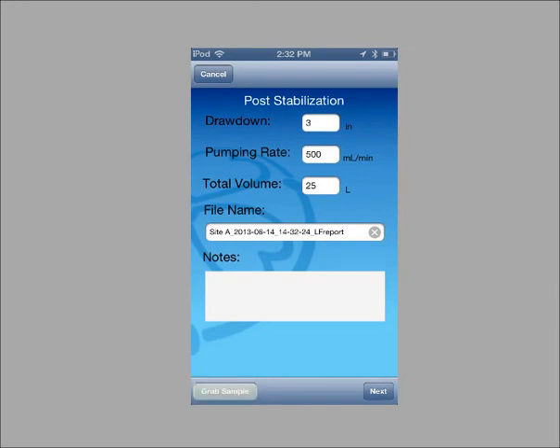You can enter grab sample information and when you are finished, tap next.